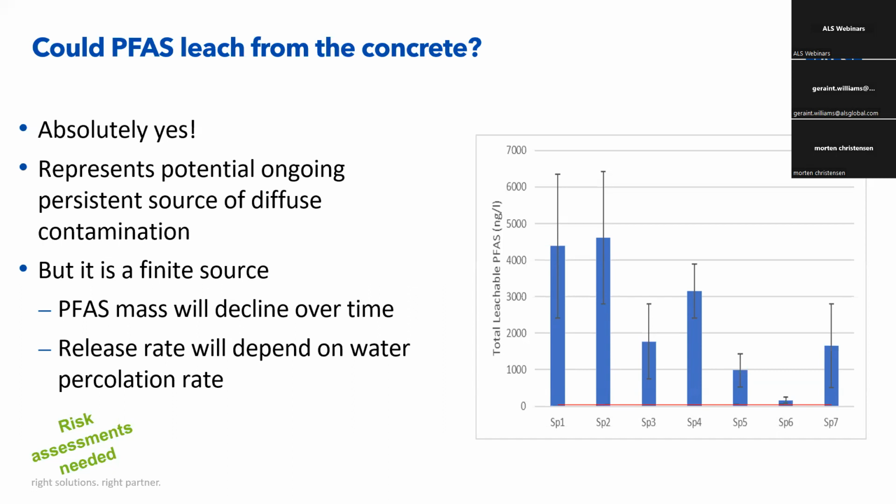But we did find that PFAS can certainly leach from concrete. So that might be a consideration, taking into account the different leaching options that are available to us. We certainly found that PFAS can leach from concrete using different analytical tools to do that. We have a specific type of leaching test that we carry out, but I'm sure there are various different options, and I'm sure you'll find the same thing. There have been various research papers published on this subject, and they've all come up with similar conclusions, that certainly PFAS can leach from concrete over time.